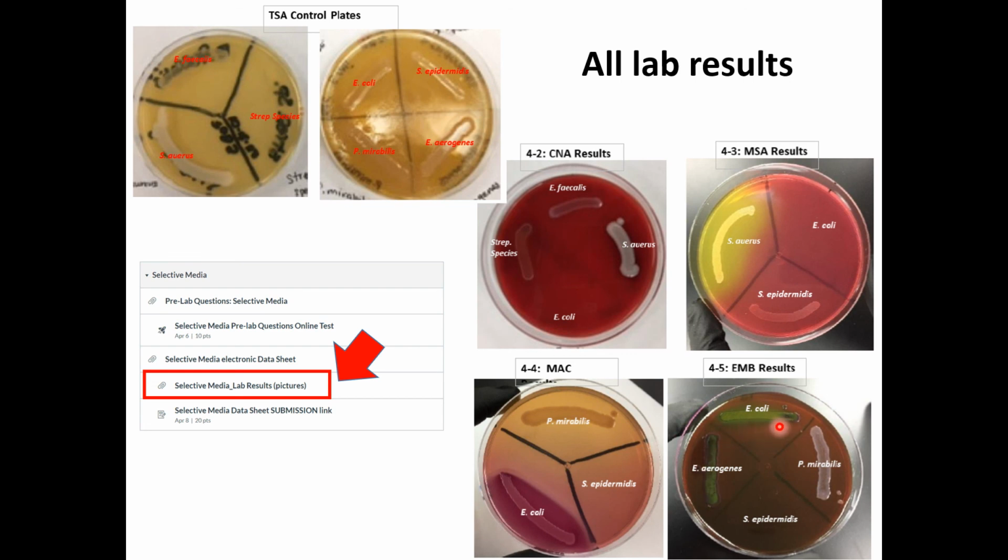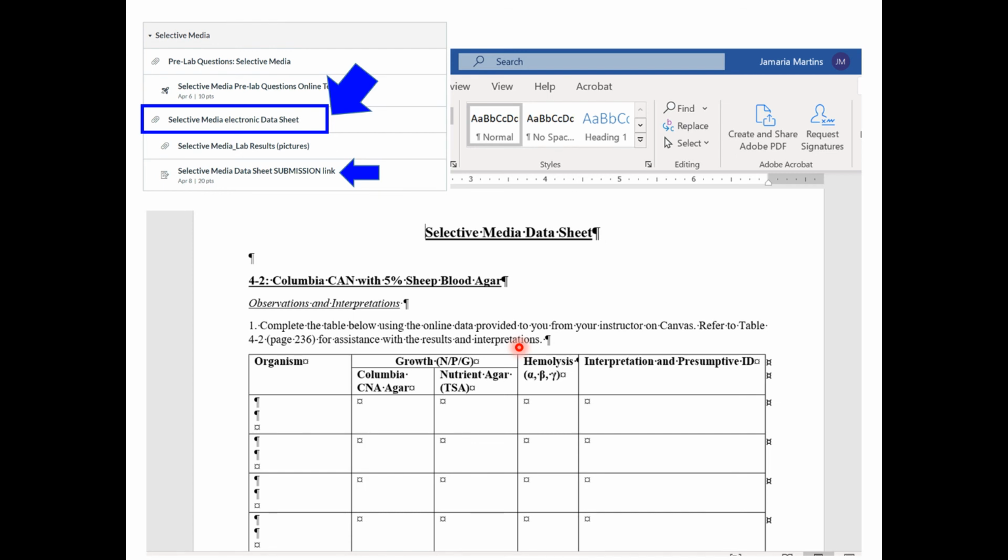The metallic sheen looks more realistic when you actually see the plate; for E. coli we don't see it, it is more purplish when we actually look at the results. But this is just another way to see it, okay? In addition to the results that I showed you on the PowerPoint slides, you can base on this to answer your questions as well.